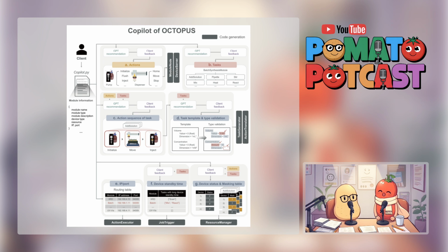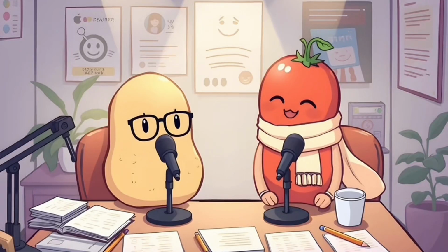Well, one thing they're focusing on is the user interface. Makes sense. What are they thinking? Right now, it's all command line based, which can be a bit much for researchers who aren't coding wizards. Yeah, if you want people to embrace a new tool, got to make it user-friendly. Exactly. So they're working on a more intuitive, web-based interface, something anyone can pick up quickly. Okay, that makes sense. What else is on the to-do list?